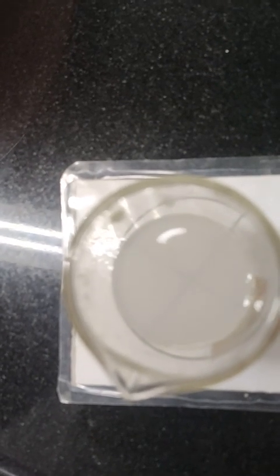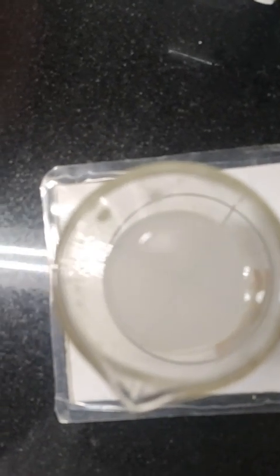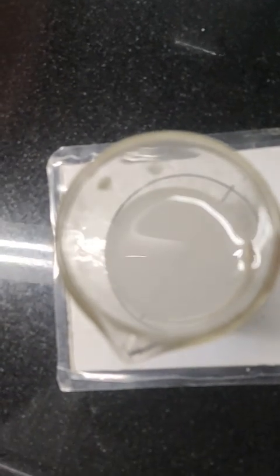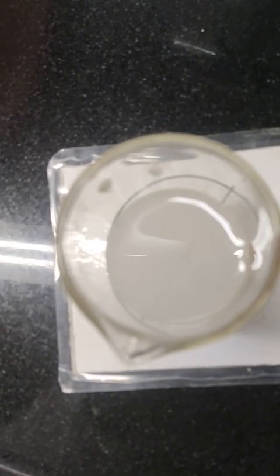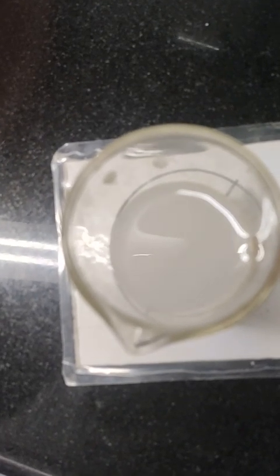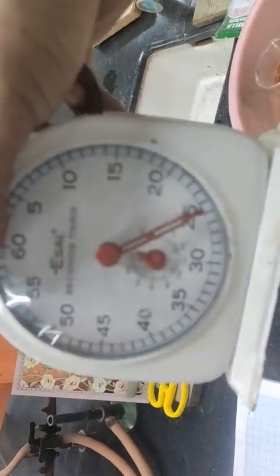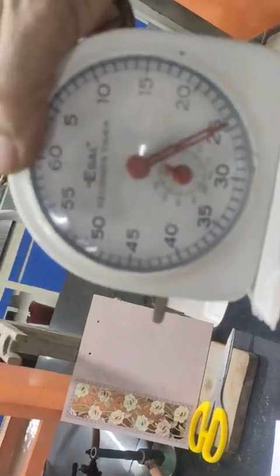And see, the line has disappeared. So I will say that the reaction has gone to completion. Now I have stopped this stopwatch and I am recording the time.